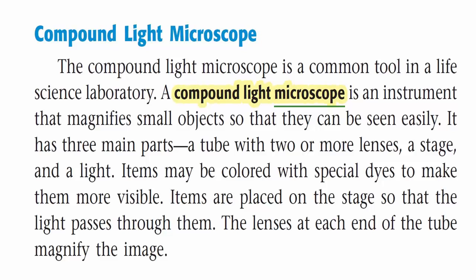Items may be colored with special dyes to make them more visible. Items are placed on the stage so that the light passes through them. The lenses at each end of the tube magnify the image.